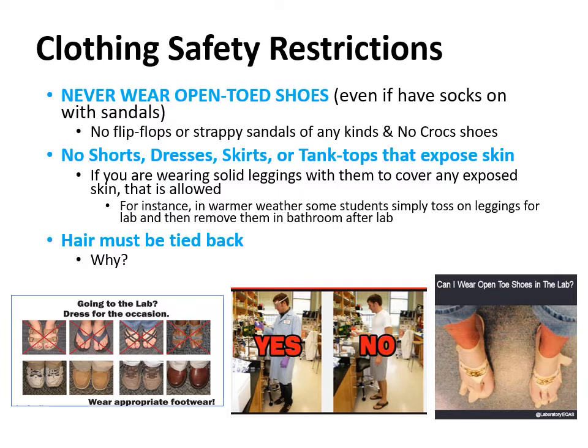Okay, and because I was wearing sandals, I then had to do crazy protocols of proper cleaning, and I lucked out that I was not seriously injured. But I could have gotten very sick from that, okay, because you never know what other people are going to be doing in a lab. You can be the most careful person in the world, but you don't know what those around you will be doing. So always make sure to be careful about wearing properly closed shoes.